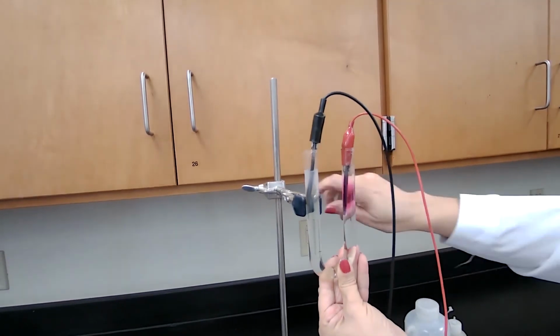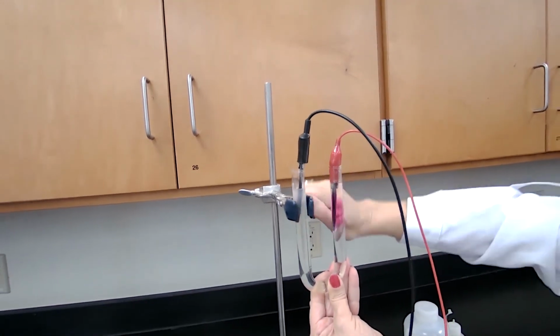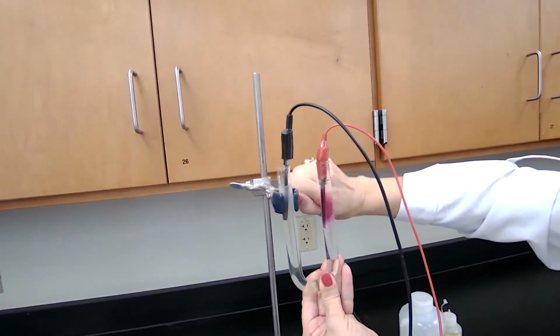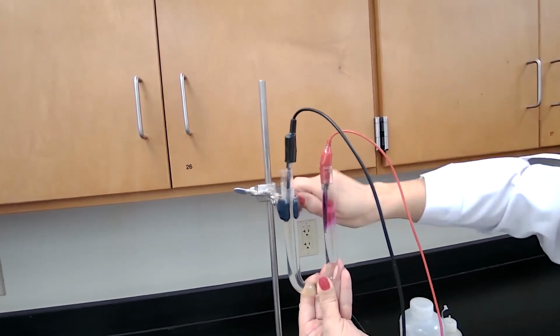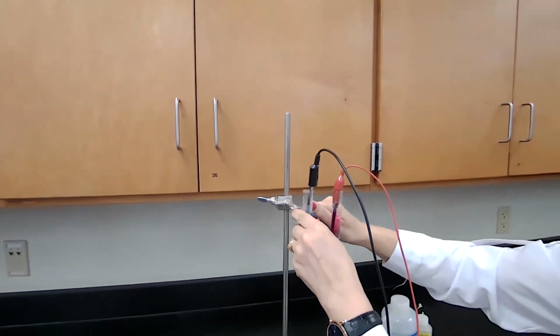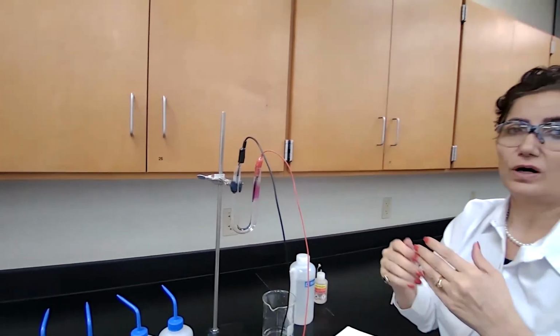Okay, this is the last reaction that we are going to test for oxidation reduction in the electrolytic cell, using a battery to supply electrical energy for our study of these reactions. Just make sure to look for all the choices.